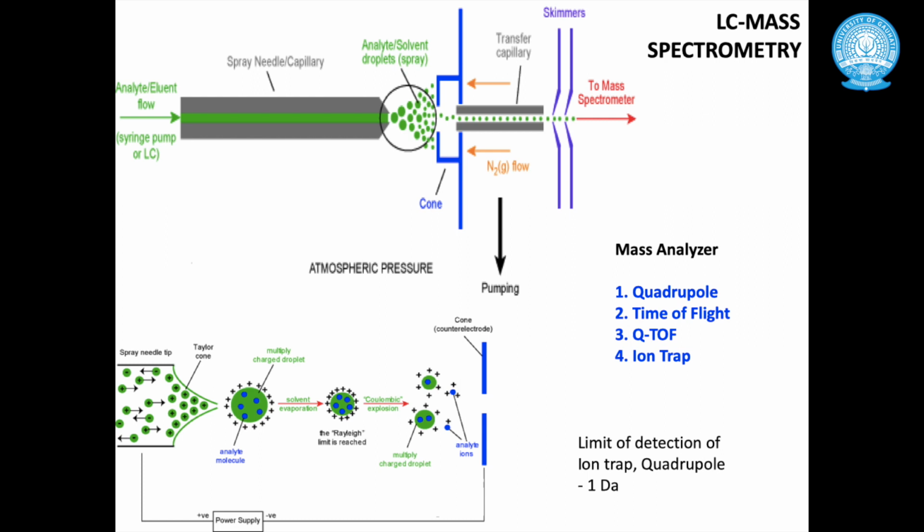So in the lower panel, the spraying of the droplet and how the charging of the droplet happens, and upon desolvation, or shrinking of the charged droplets at high temperature, that is called desolvation.